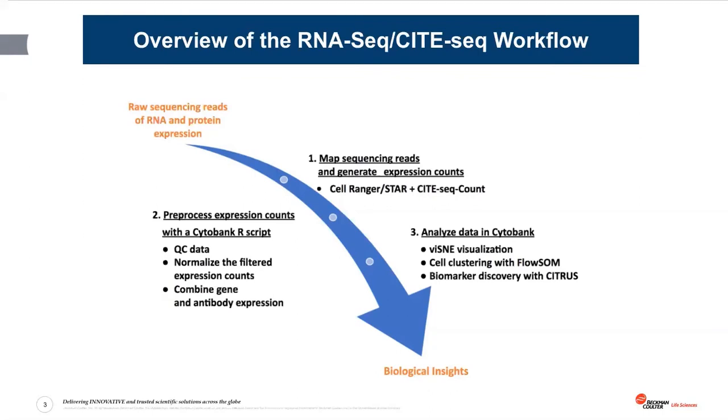And for image data, the workflow will be different. Actually, it's more simple. For image data, you will need to use some third-party traditional image analysis software to get image feature data. So for example, you can use CellProfiler, which is developed by the Broad Institute, I believe, and you can use the software to generate image features such as the length of the cell and the size of the cell and different kinds of features.